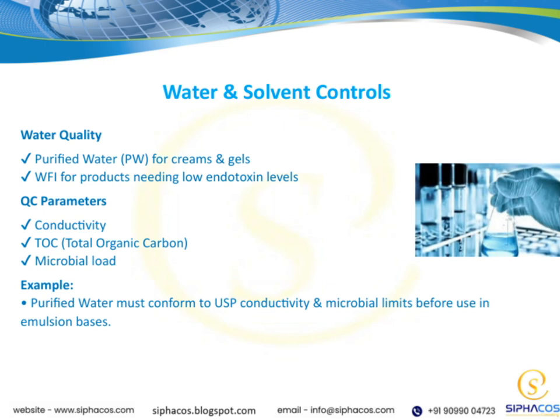Then there's TOC, which stands for total organic carbon. This test measures organic contaminants that could affect product stability or safety. And of course, microbial load is critical. We need to ensure the water isn't contaminated with bacteria or fungi.